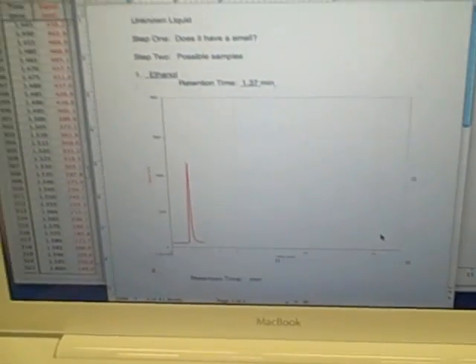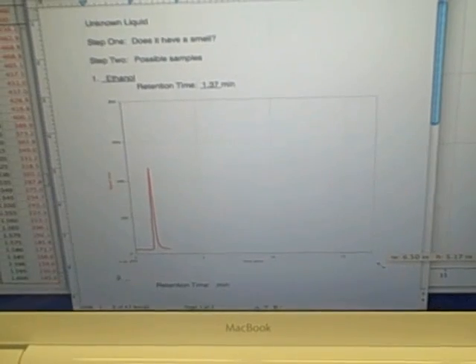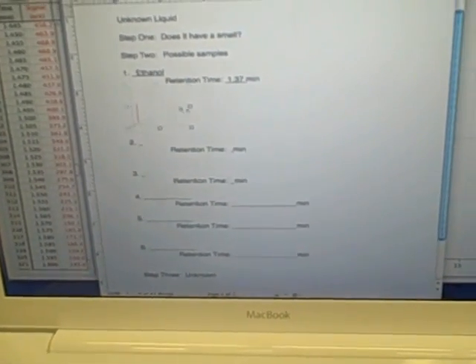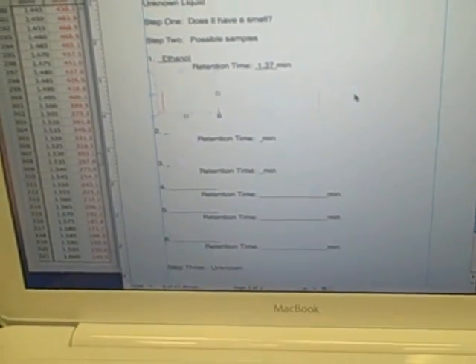By clicking on the graph, we get the resizing arrows. Click off, click back on, we can move this graph wherever we wish.